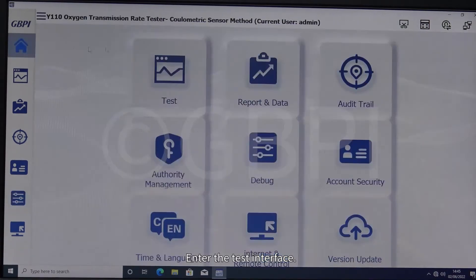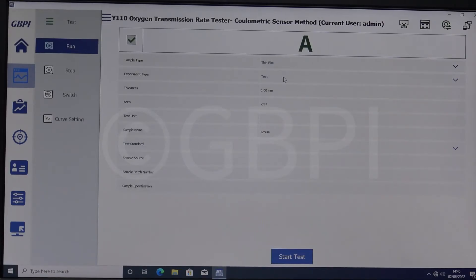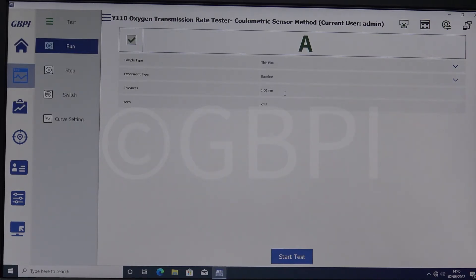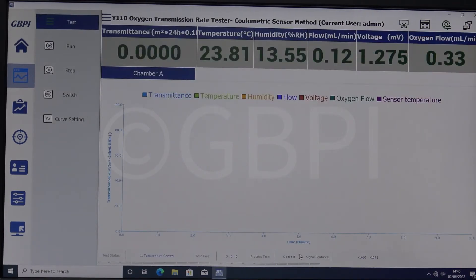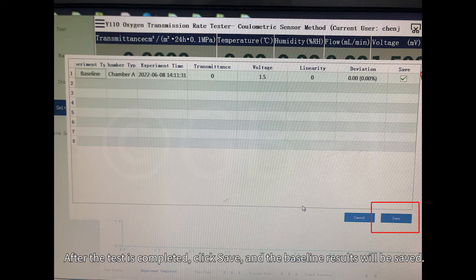Enter the test interface. Select the baseline mode to start the test. After the test is completed, click Save, and the baseline results will be saved.